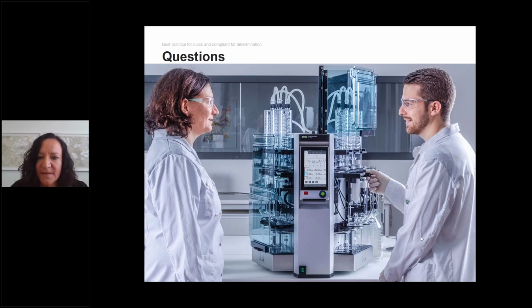Another question is if the celite passes through the frit during the extraction process, in the beaker or in the extraction chamber, so how do we get rid of the celite? So first, if celite breaks through, you have to make sure that the amount of sand you use in the glass sample tube is sufficient. So really make sure that your sand bed is 20 grams for the new instrument or 50 grams for the old instrument, because then you can prevent most of the celite passing through.